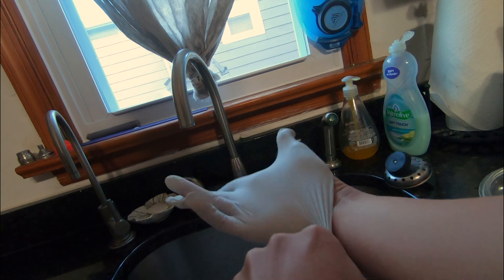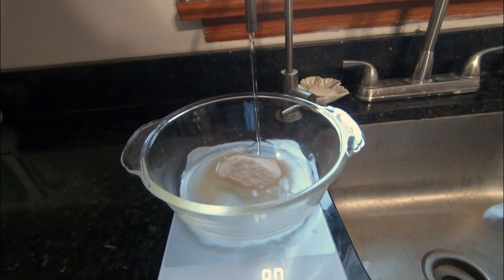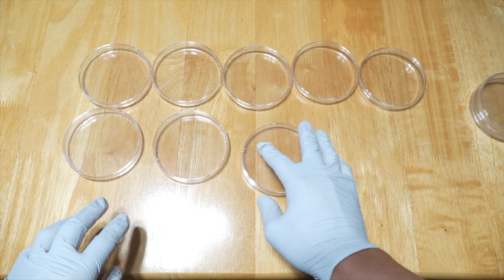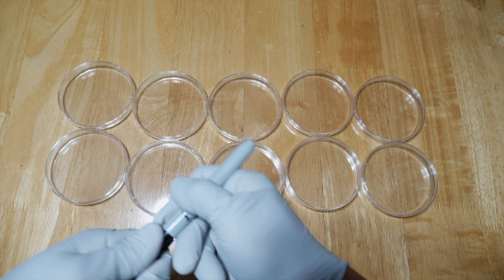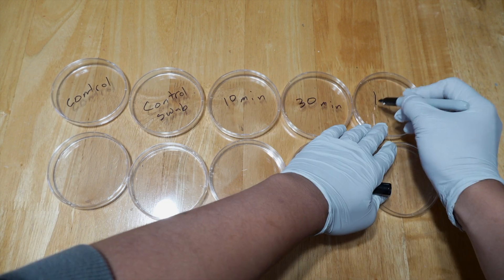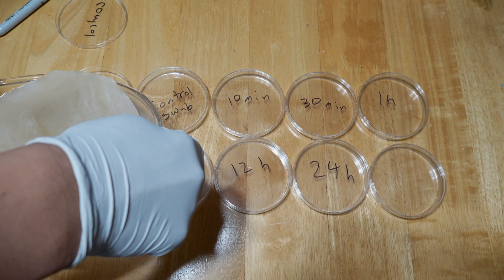Before we get started, we need something to grow these microbes in. That's where agar comes in. Nutritional agar is a gelatinous substance derived from red algae and fortified with nutritional yeast and complex sugars. These not only help with cultivating fungi, yeast, and bacteria, but also can act as a vegan substitute for gelatin. We're going to need nine total dishes. Two are controls: one of just the raw agar, and one for my hand directly after I wash and sanitize. This will give us an accurate sample to compare with, just in case soap and hand sanitizer are lying about how much bacteria they kill.